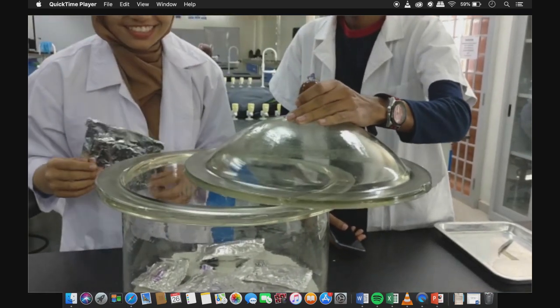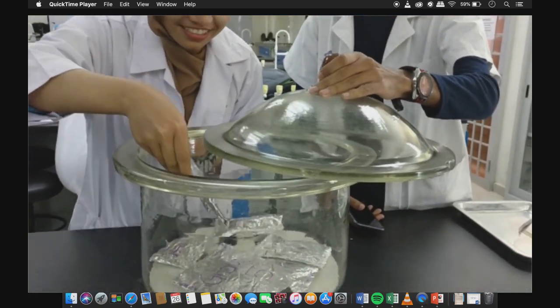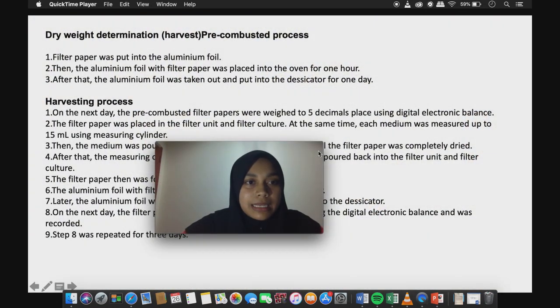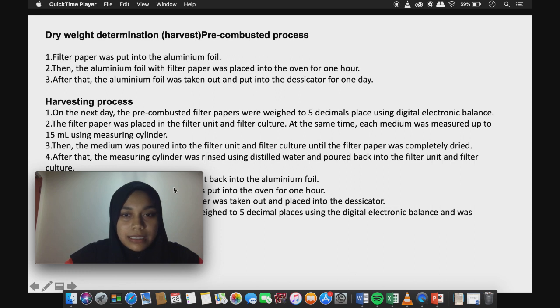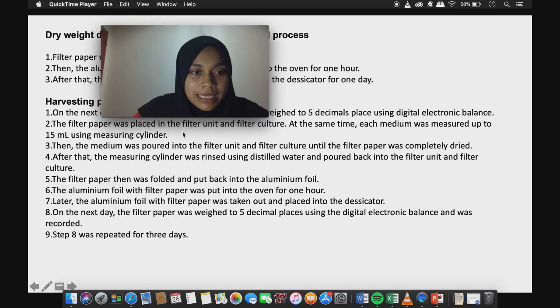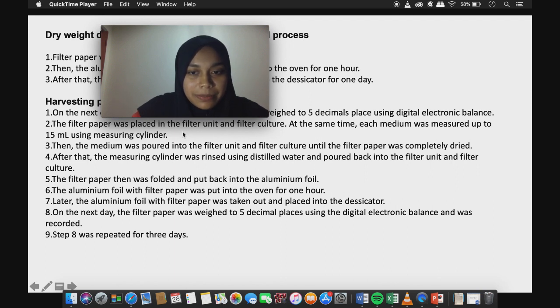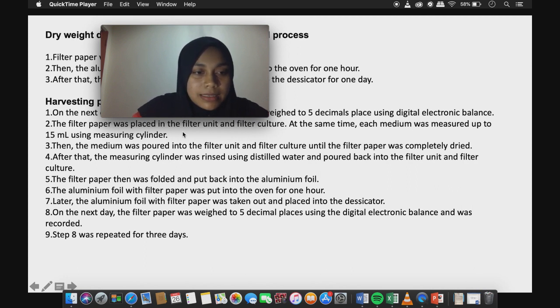For the pre-combustion process, filter paper was placed into aluminium foil, then placed into the oven for one hour. The aluminium foil was then taken out and placed into the desiccator for one day. Each medium was measured to 15 ml using a measuring cylinder, and the foil with filter paper was again placed into the oven for one hour and then into the desiccator. On the next day, the filter paper was weighed to 5 decimal places using a digital electronic balance and recorded. This step was repeated for 3 days.